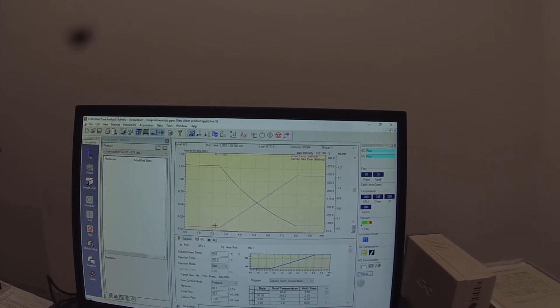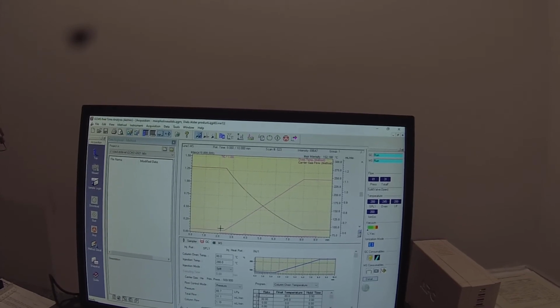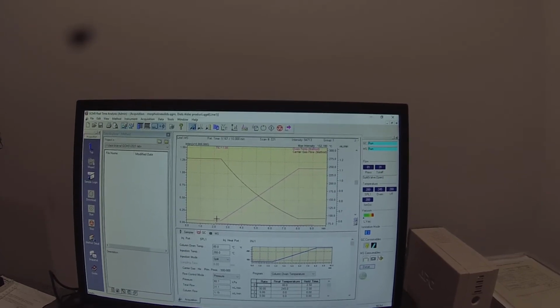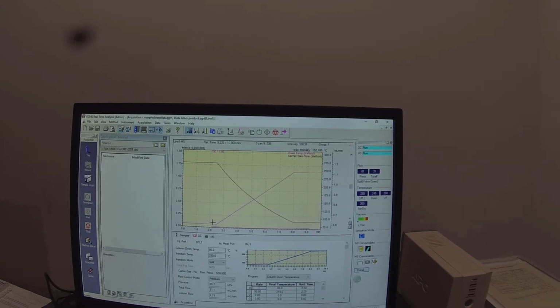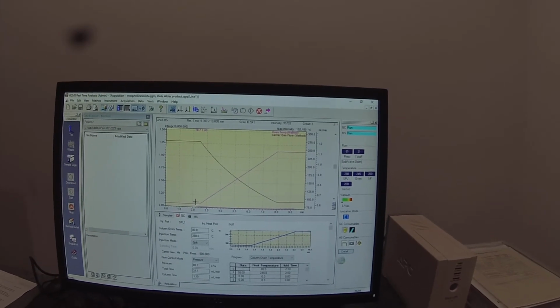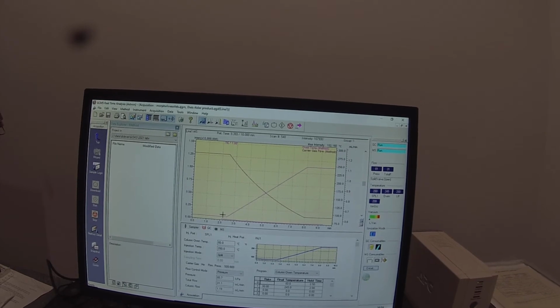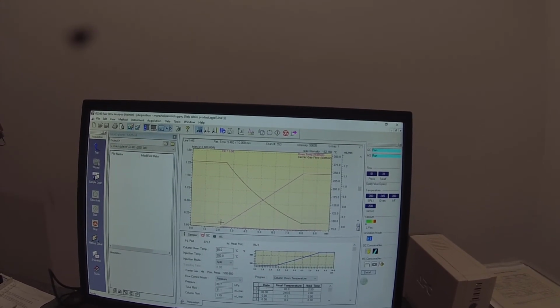Got another 60 seconds. It's highly unlikely that the compound was volatile enough to have come off in the 2.5 minute or the 2.1 minute solvent cut time. So if we see nothing here, the logical thing to do would be to dramatically increase that initial temperature. So we're running for a longer time at the higher temperature.